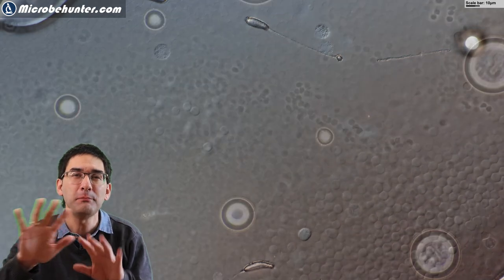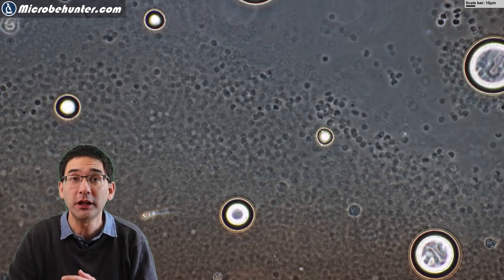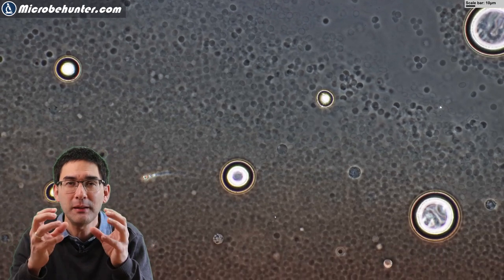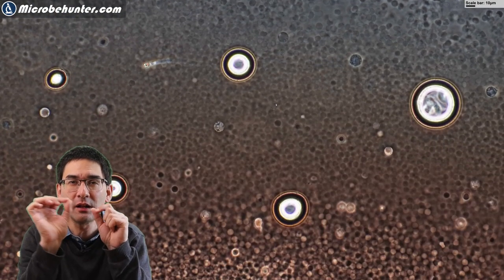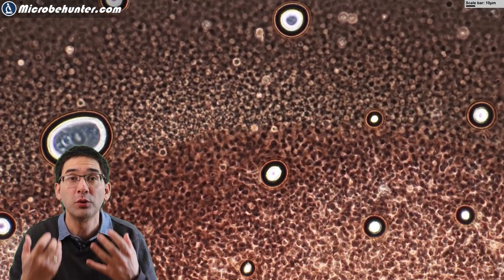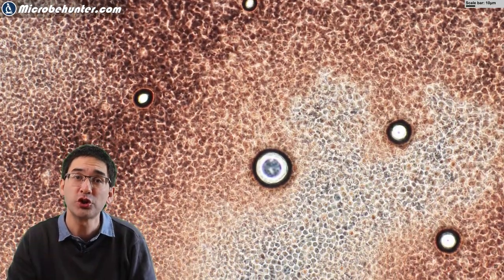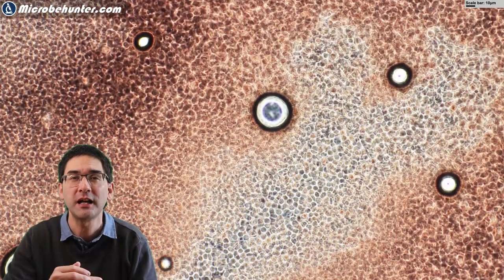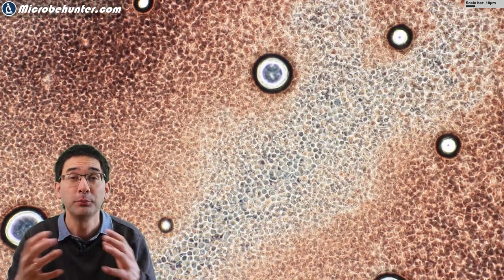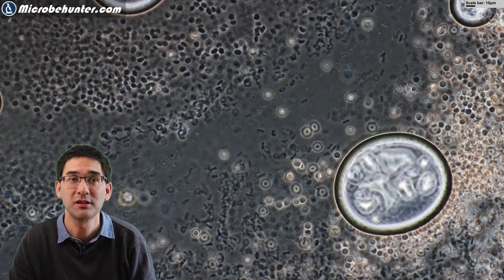Now you can also see a little bit the pinkish surrounding here. Again, in phase contrast, the bright circles, these are air bubbles again, and now you can see those so-called ghosts, those empty red blood cells. They are seen as dark little structures. Towards the center of the slide where most of the blood cells are still intact, this is where I could still see the original shape much better. But on the periphery, on the side where it contacted the distilled water, many of the cells I think popped open and formed those empty red blood cells called the ghosts.